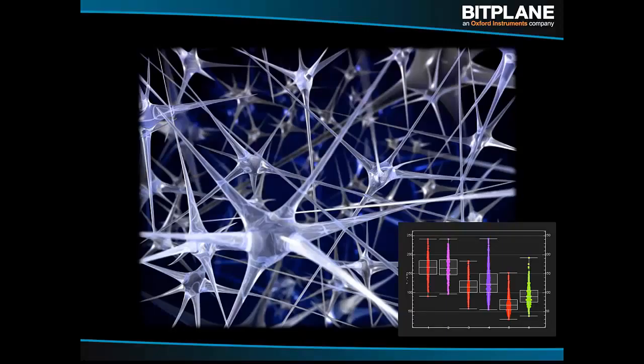This kind of plot is really useful at dissecting out interesting or meaningful information out of a really complex, really large data set. That's several hundreds of thousands of points of data, so individual cells. And these are different groups. So there's 6 groups here. Each group probably has some hundreds of thousands of cells, and they're all plotted there. And this is still performing quickly.